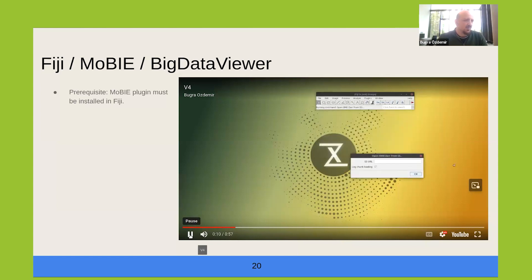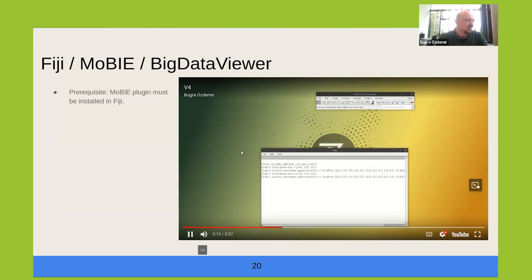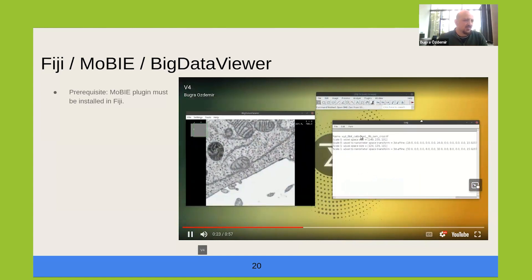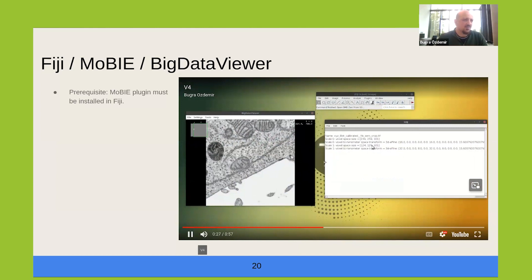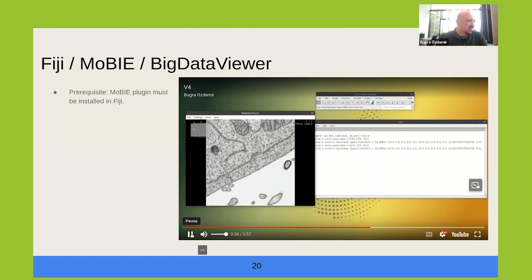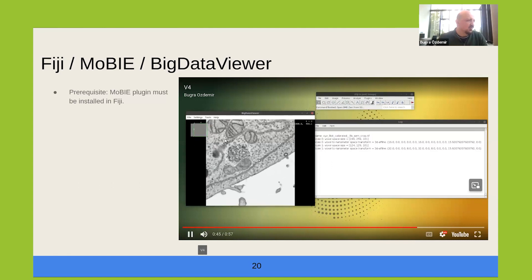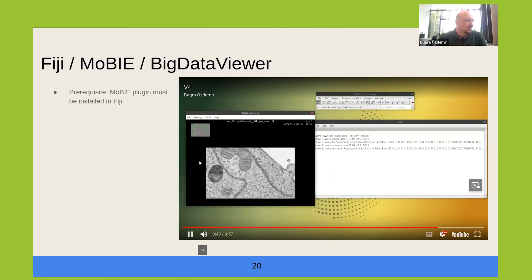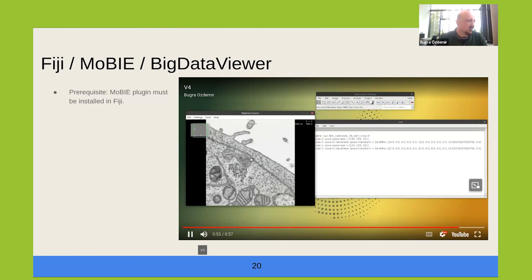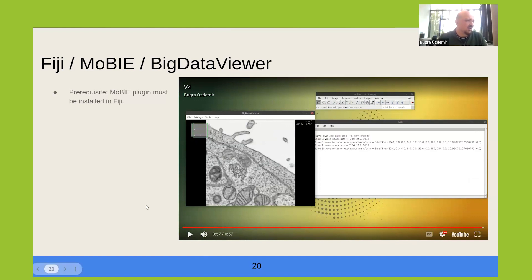Choosing to view from a public bucket, a pop-up window appears where you simply put the full path to the OME-Zarr and click OK. You get two windows — one shows the different resolution layers, their shapes, and scaling information. Even for smaller images it is very smooth: you can scroll through, zoom in and out, and perform rotations as you normally would in Big Data Viewer. This also works with very large terabyte-scale image data, as long as you have optimal chunking and a sufficient number of resolution layers.